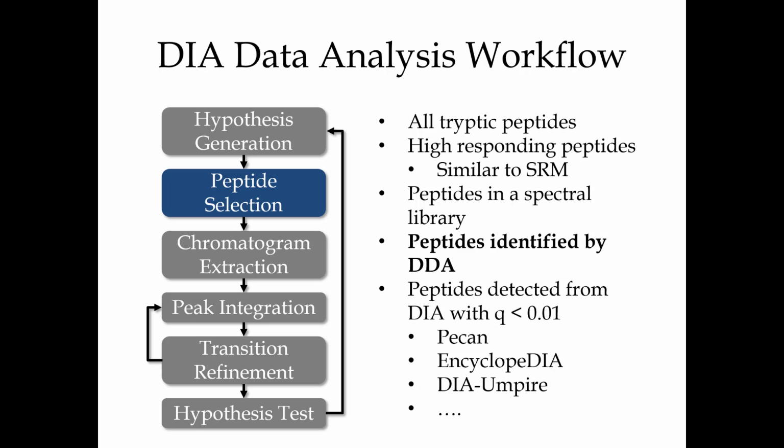And now there are emerging tools where you could actually do peptides detected from DIA. So you could, and it can be, again, separate DIA runs.